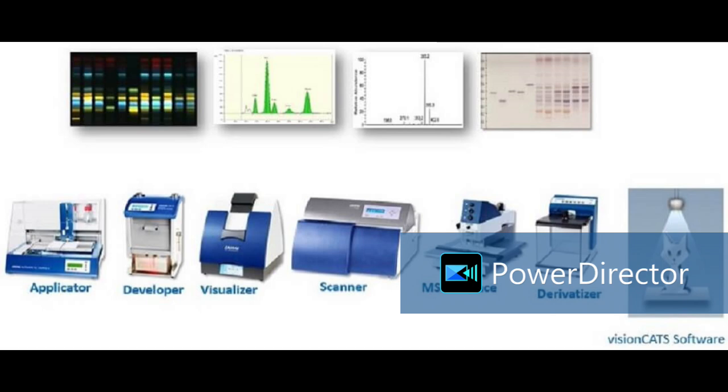That's all from my side on instrumentation and applications of HPTLC. We will see the live demo in the lab within 5-10 minutes, after the break. We will start the demonstration and I will show you the software and hardware part in our laboratory. Okay, thank you. We are not only traders, we are technologists also.